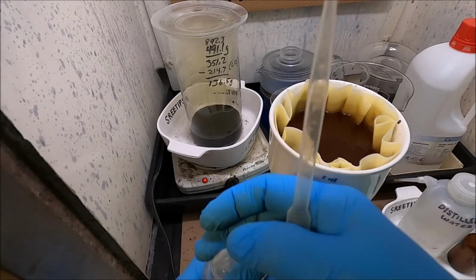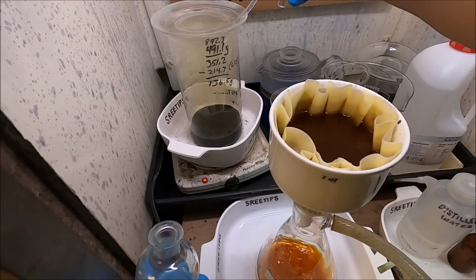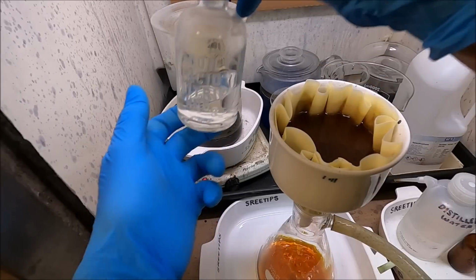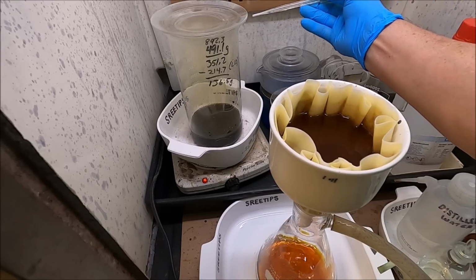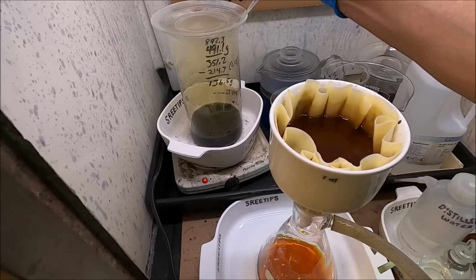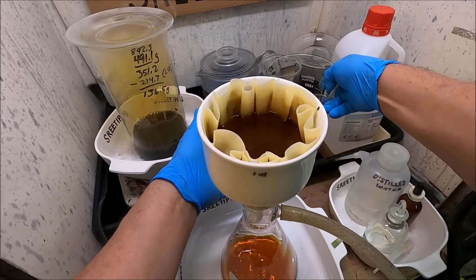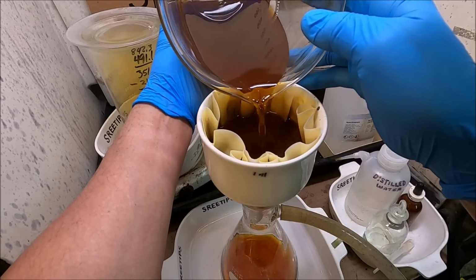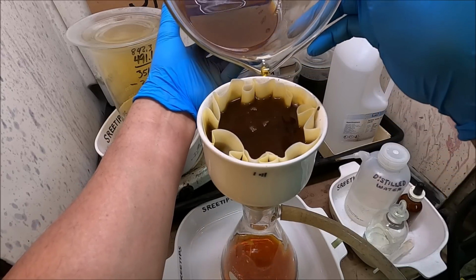While we're waiting for this to pull through this filter, I'll get another half a shot of nitric here and start adding a little bit more nitric to the solution in this beaker. See if we can extract some more precious metals out of those solids. Not seeing a lot of fumes there, man, so that's telling me that I don't have a whole lot of precious metals in solution back here. This deal right here is going real well, man. I'm getting the gold out of here, and we're getting the platinum group metals filtered down into the flask so that we can process those.